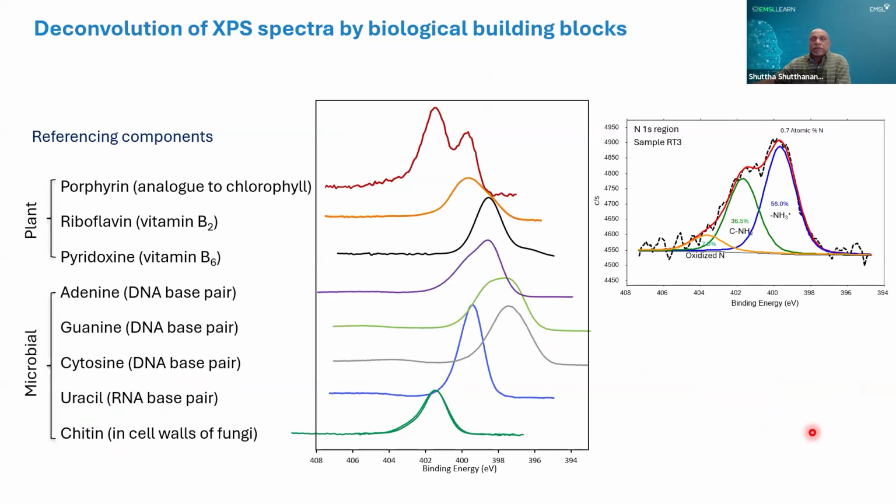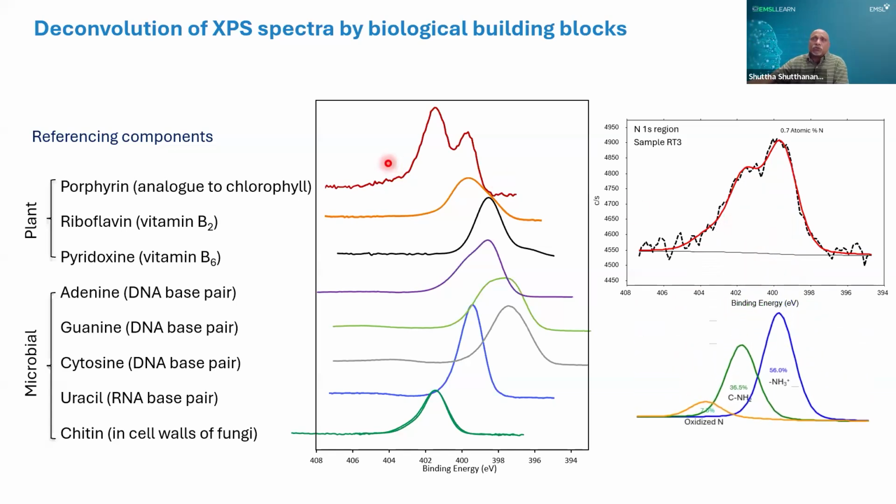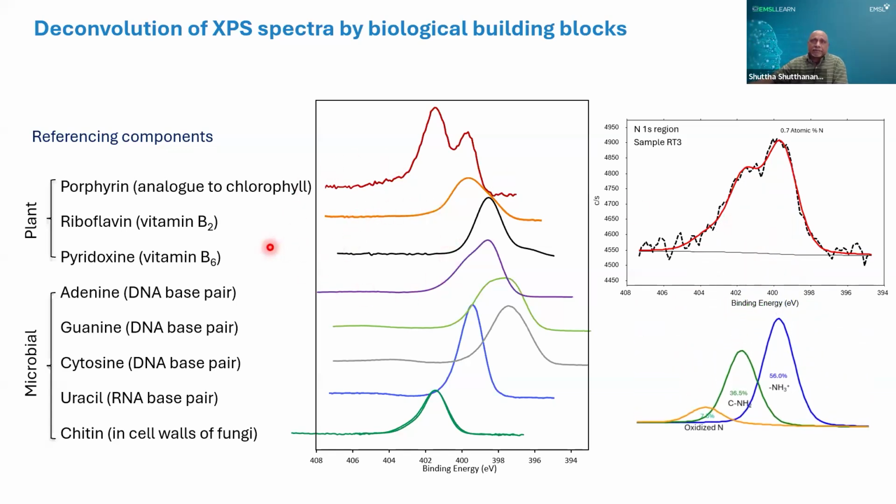So this is one example. And then Ajay will talk about this more here. This is the conventional way of analyzing that sample. We put different peaks here, using our knowledge. But we can also do it differently, like shown here.